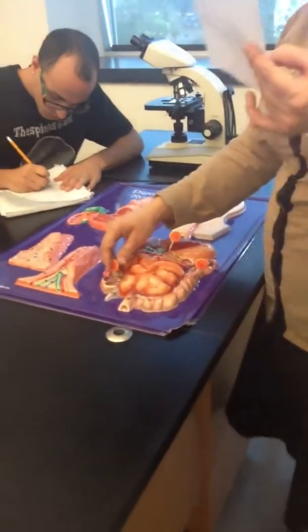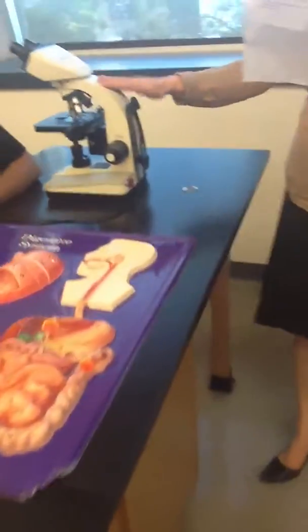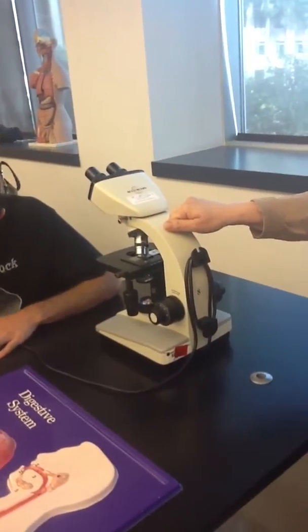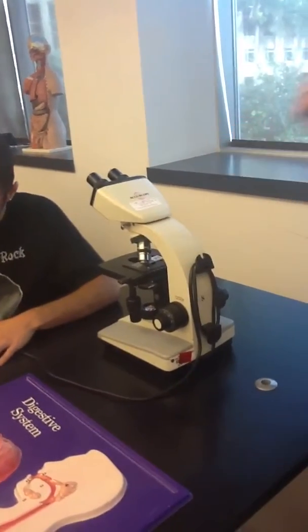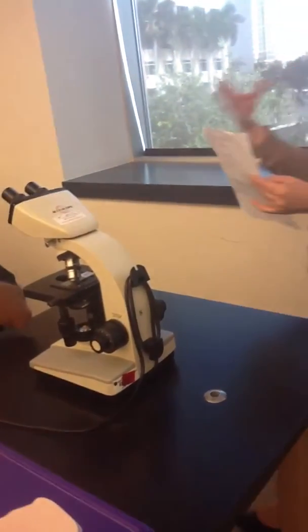And 17 is the second, okay? 18, this is the slide that is represented for you in white blood cell. If you look at it, it's a neutrophil. It's a granular white blood cell. Take a look at the different polymorphonuclears and the different lobes within the nucleus.